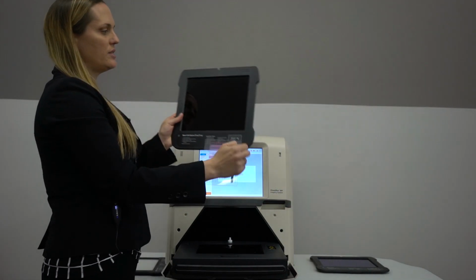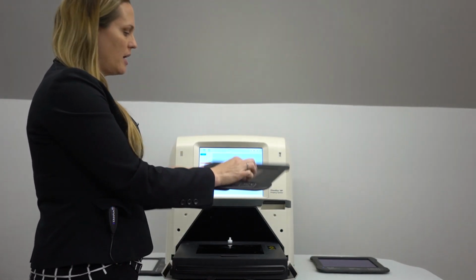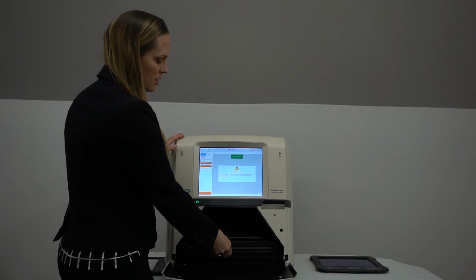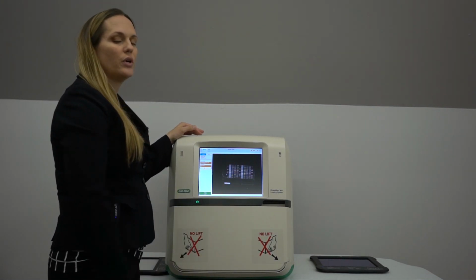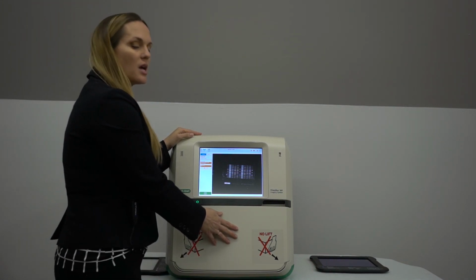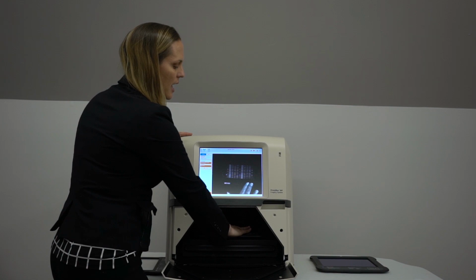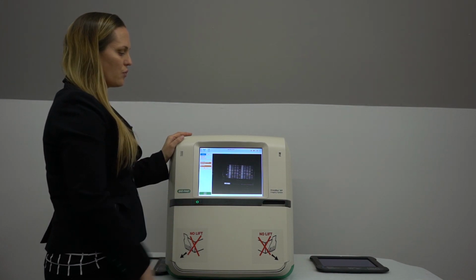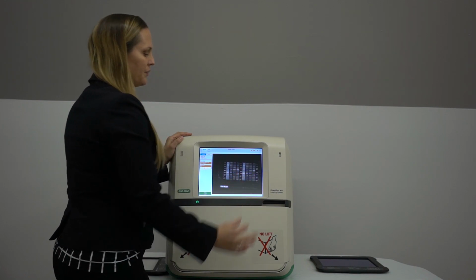And as you notice, there are little notches here on the tray, so it helps you to center your gel or your blot. And then you would simply fit it right in there, close this up, and close the door. And you can see on the screen live what's on the tray. What's nice about this kind of door is that you always have the ability to reach your hand inside and manipulate your gel and move it and turn it a little bit. Also with the screen, it's just like your phone where you can pinch and move and resize.